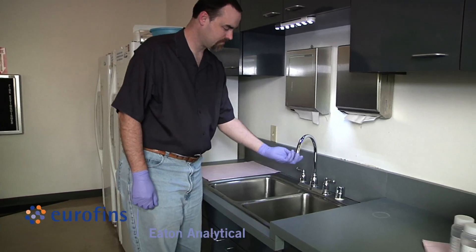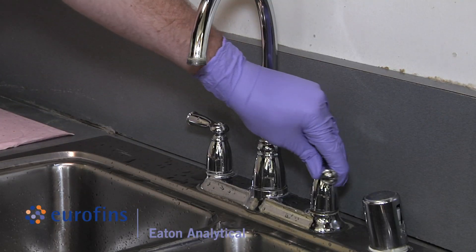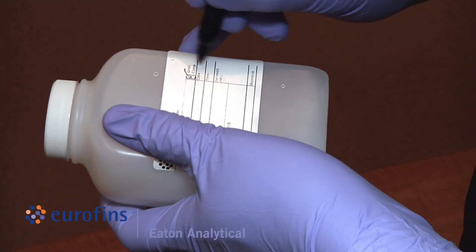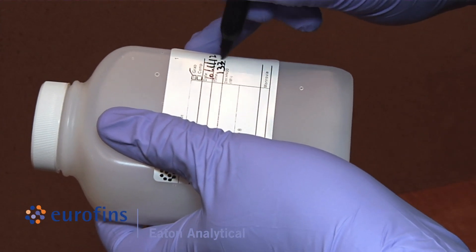Before sampling, remove the aerator and screen from a faucet or tap. Open the tap and let the water run at fast flow for approximately five minutes. Before filling, label the bottles with required information that is not already pre-printed, such as sample ID, date, and time of collection.